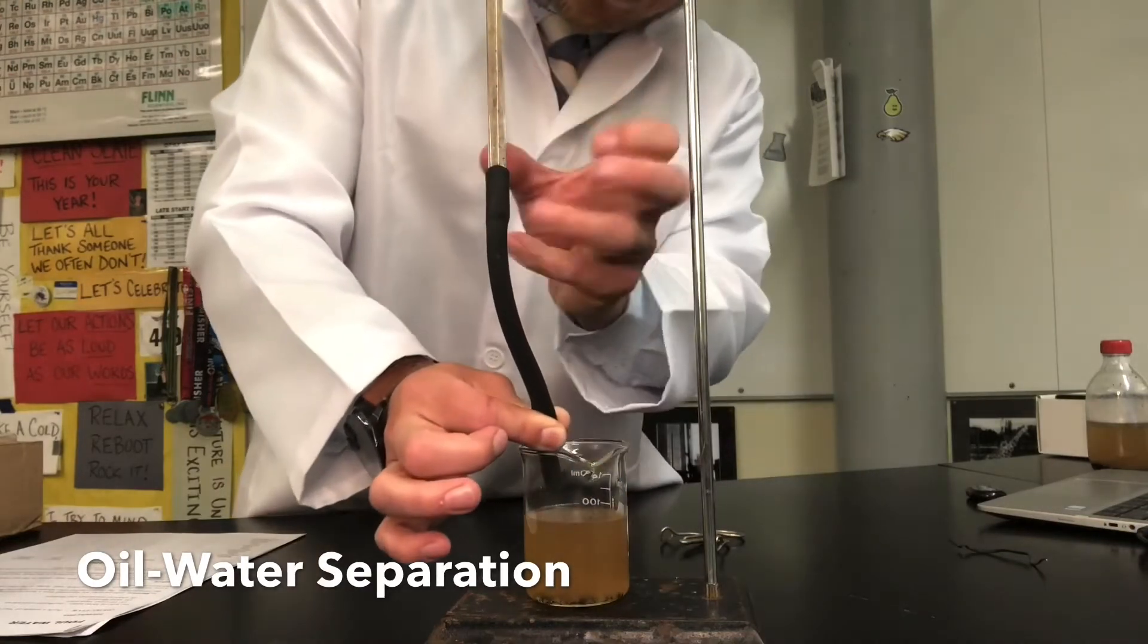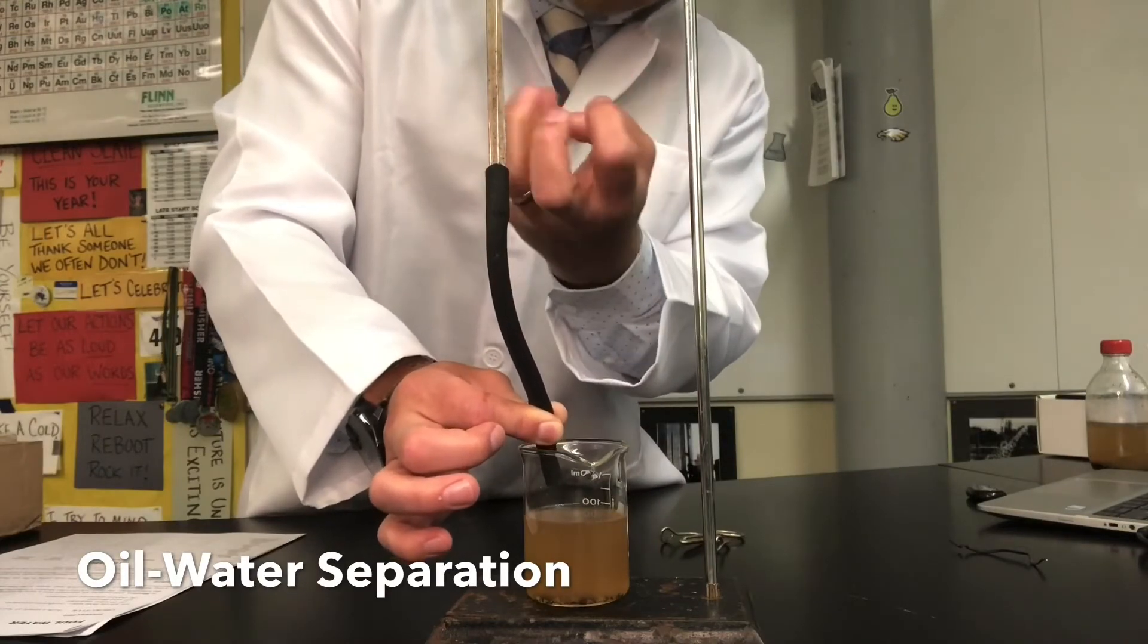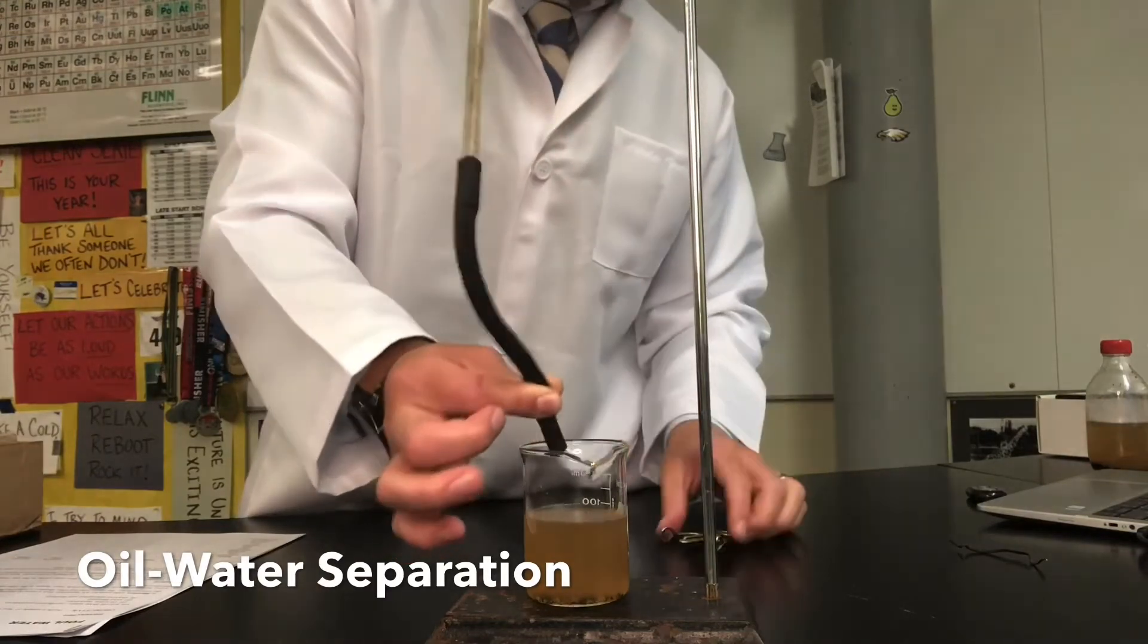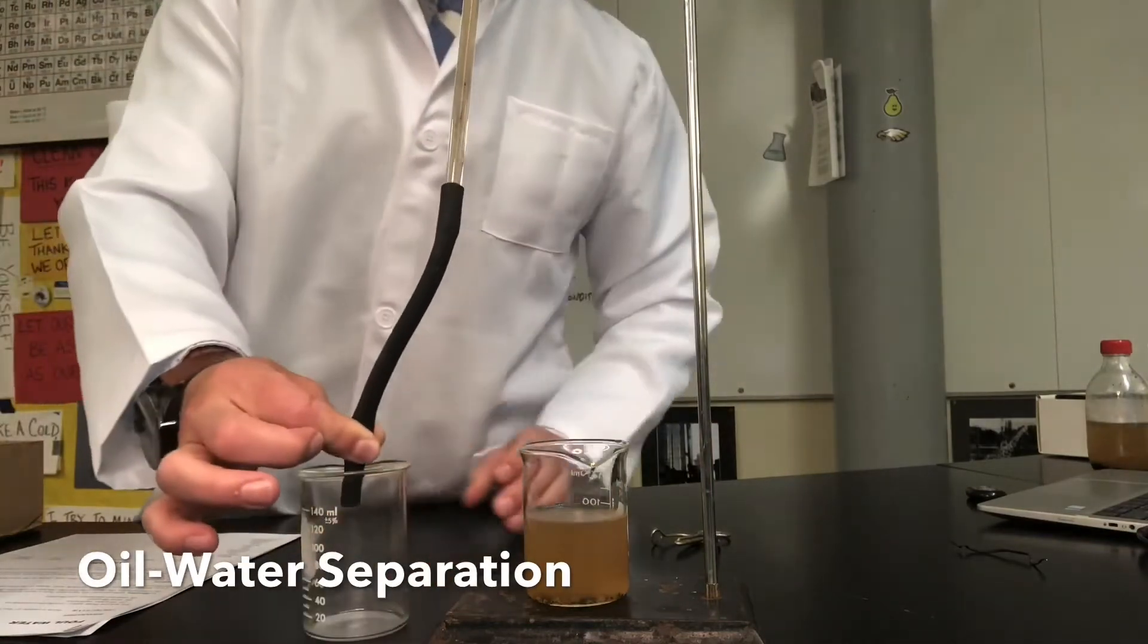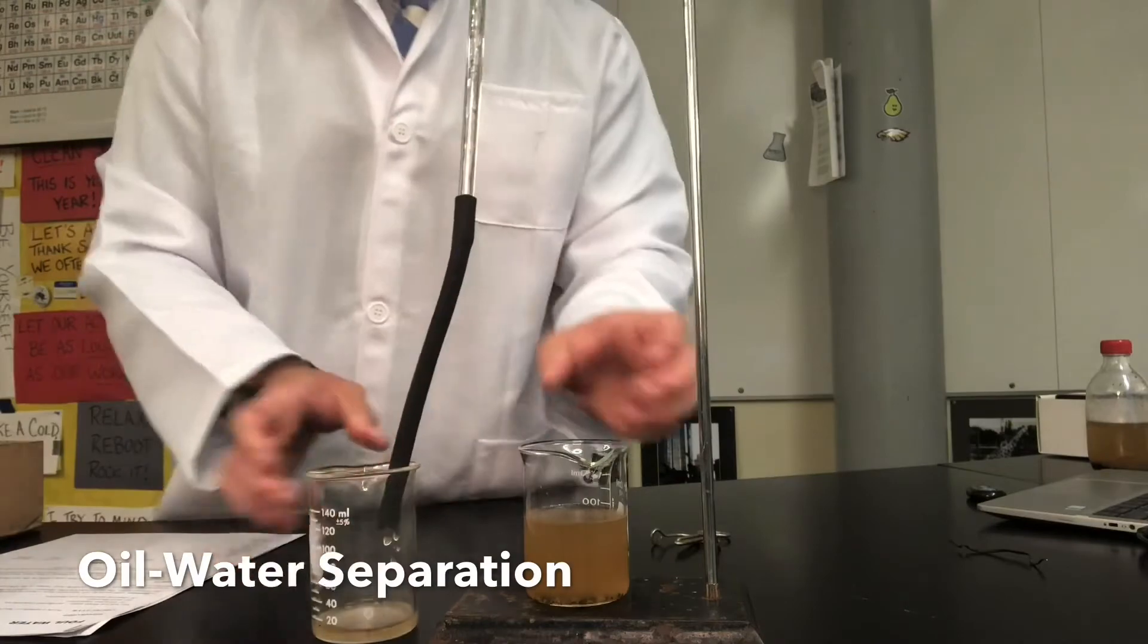All right and now you can see the little globules or little like spheres or circles of oil. I don't want that so I'm going to take another beaker and I'm going to empty that oil out into another container.